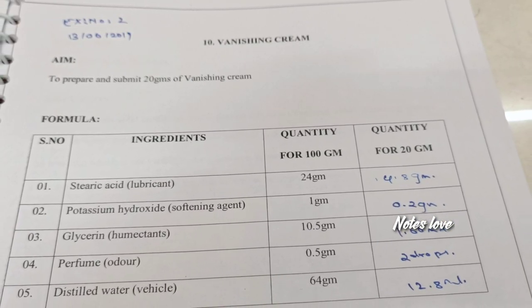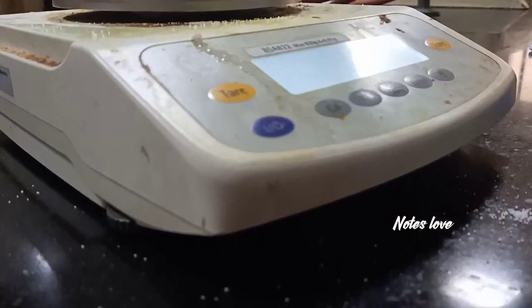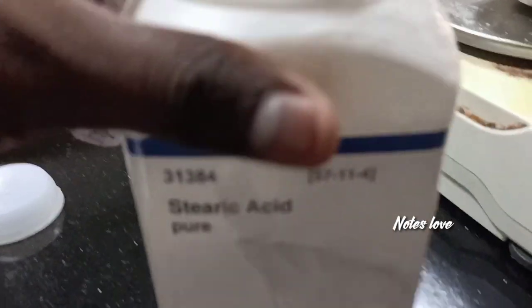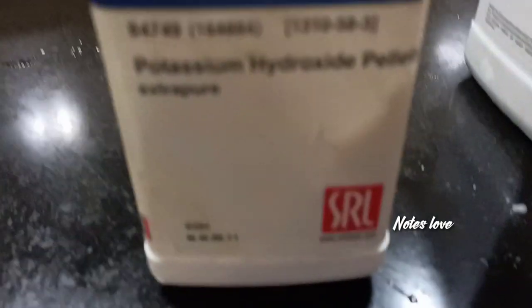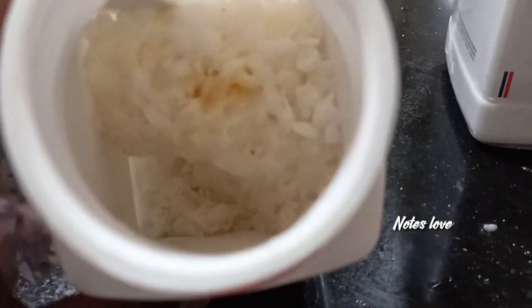If you haven't seen the cold cream preparation, I've added an icon button at the top — visit and see. First, we take stearic acid in our china dish and weigh it accurately. The other ingredients are added to the beaker, measured and added. Potassium hydroxide is one of those ingredients.